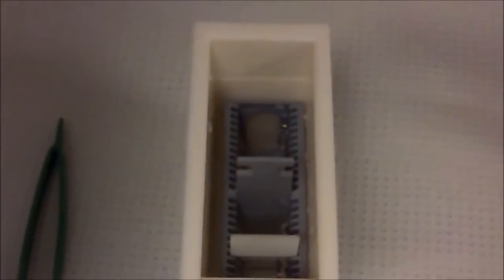All right, today we're going to do the PAS procedure to demonstrate glycogen. Step one: de-paraphenize and hydrate in alcohol.